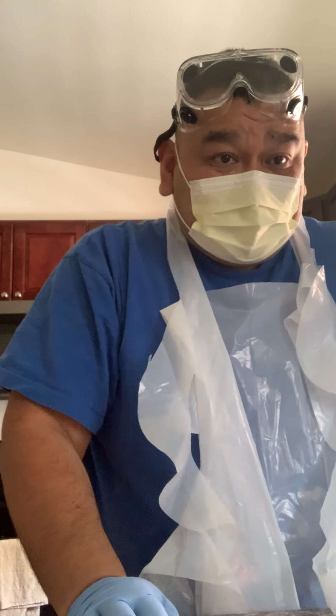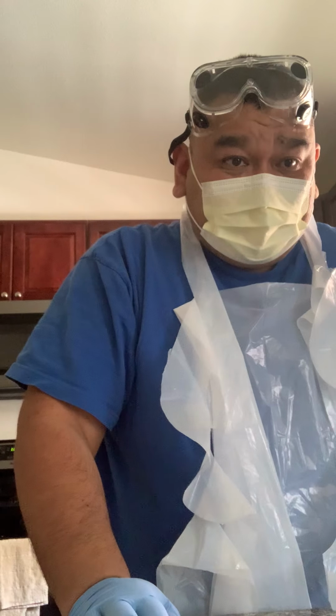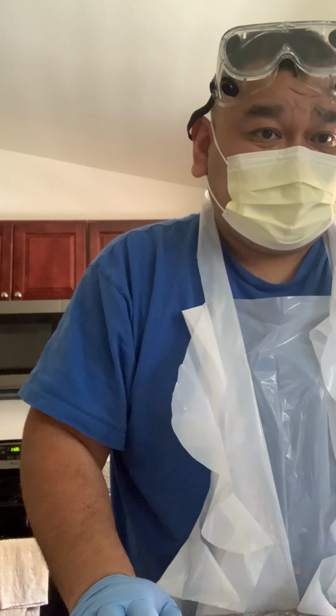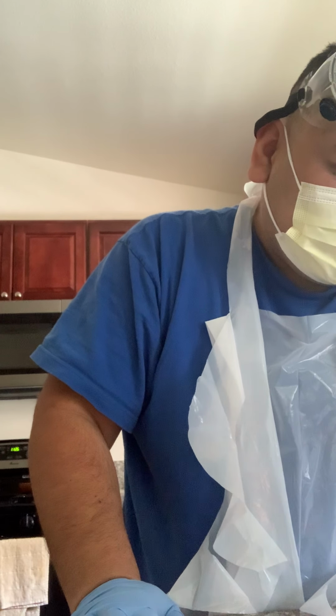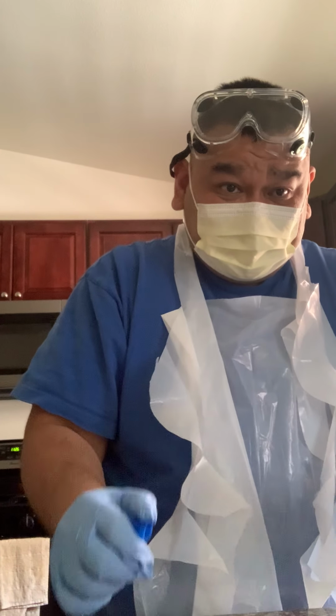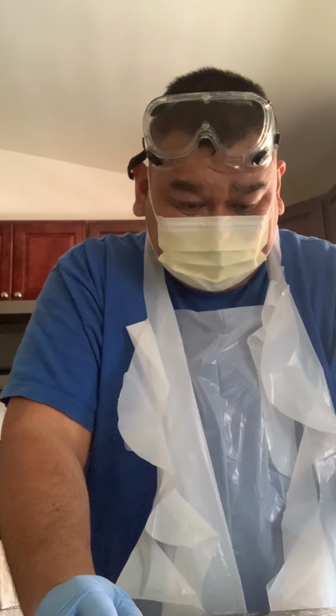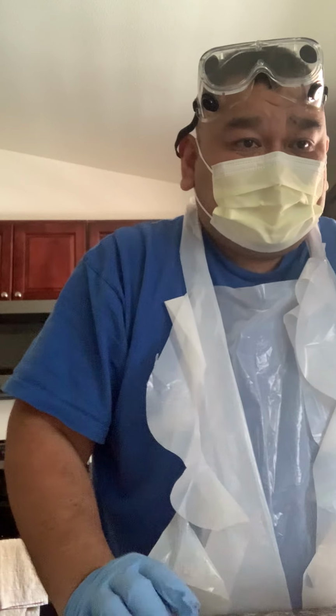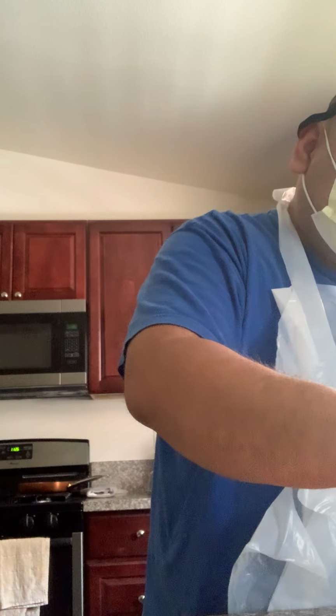And then gather active E. coli culture vials. Here's my E. coli. Remove the cap and pass the lid of the vial over the flame to sterilize it. It says remove the lid of the E. coli MRVP broth tube and flame the tip of the tubes.